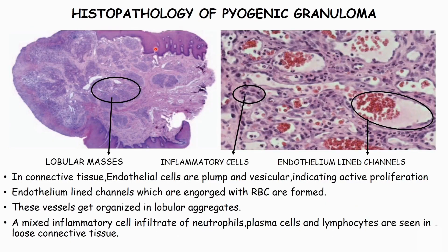The endothelial cells are plump and vesicular, indicating active proliferation. Numerous small and larger endothelium-lined channels are formed, which are engorged with red blood cells.